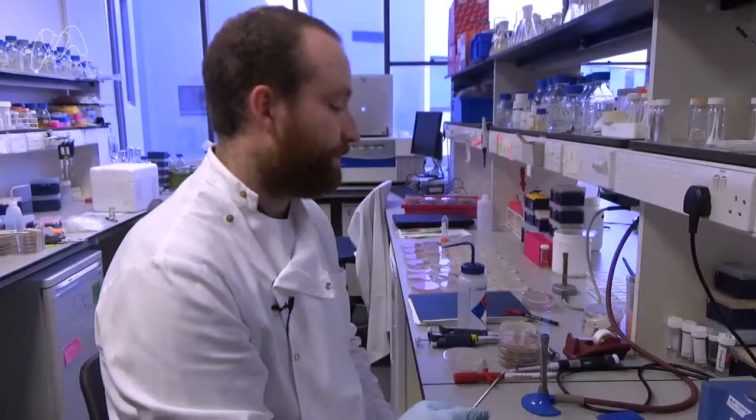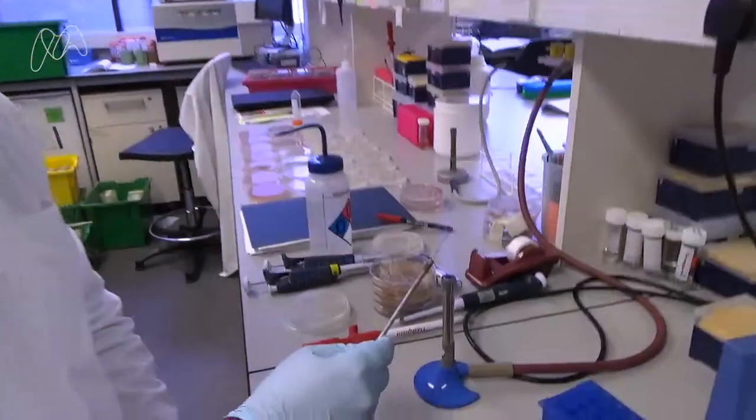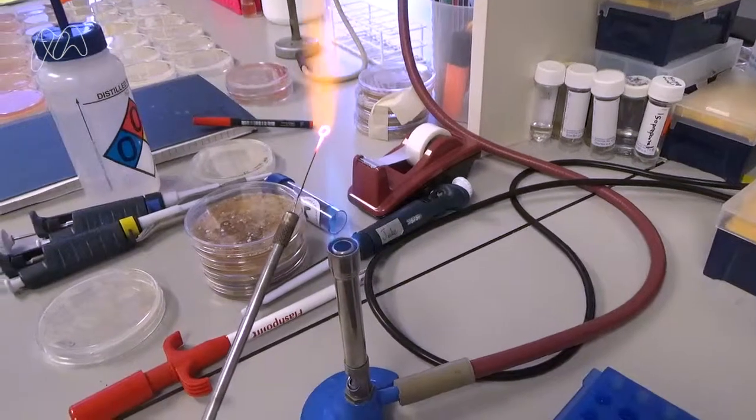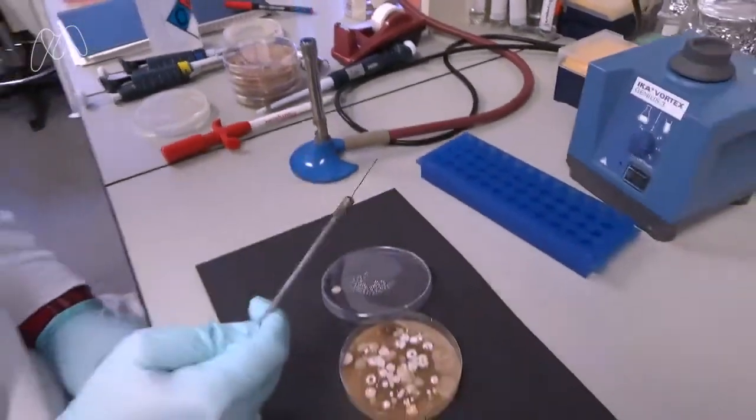This is what we use for that. This is a sterile loop that we heat up in the Bunsen burner to be sure that there's no bacteria already on there.